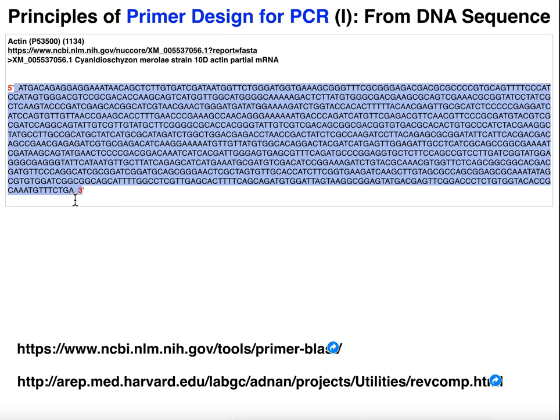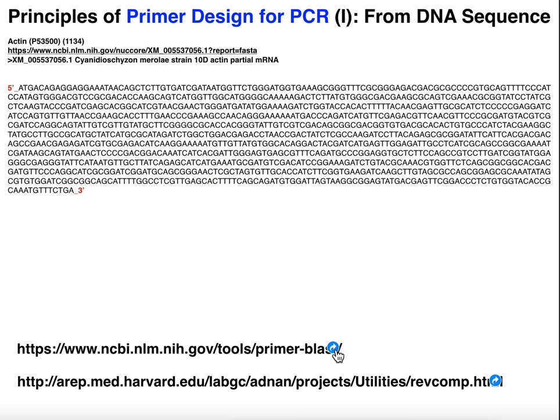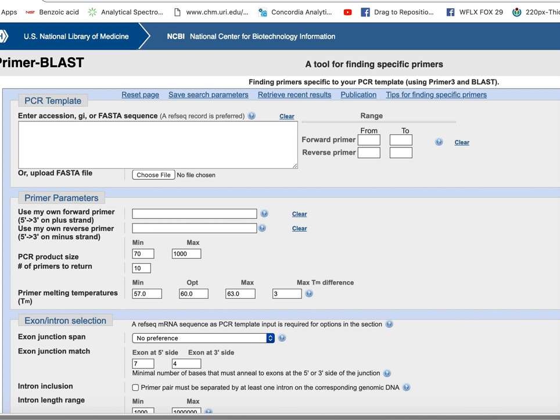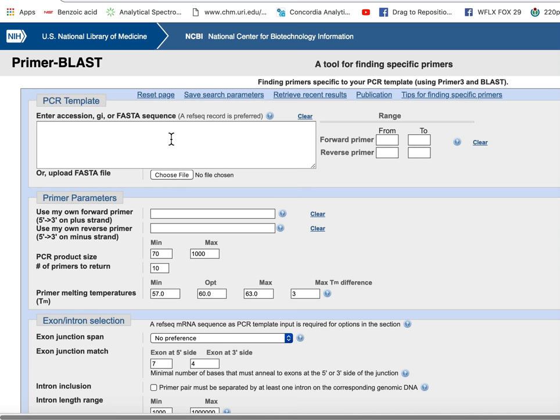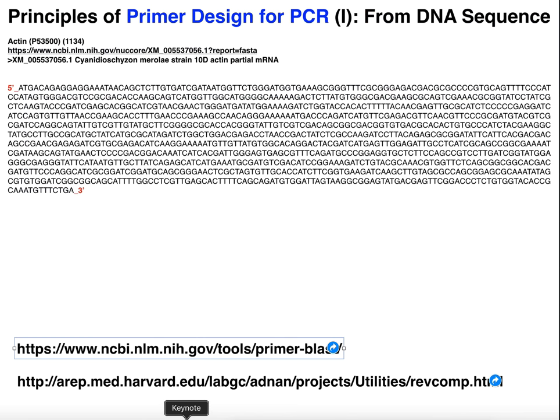Now, the reason I mention that is there are websites such as Primer Blast — a primer design website — that you can use to actually optimize the design of your primers. What you can do is take your sequence and paste it in here.